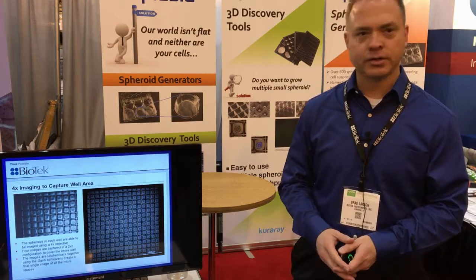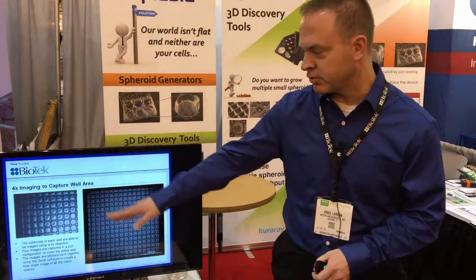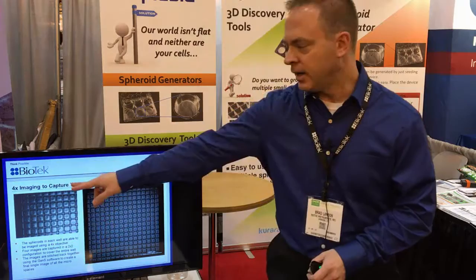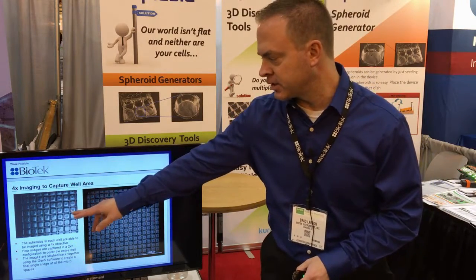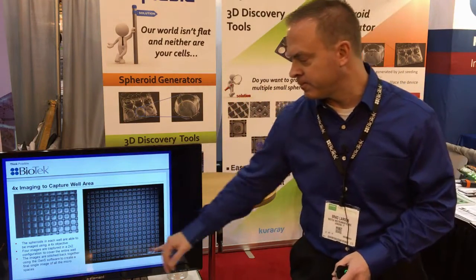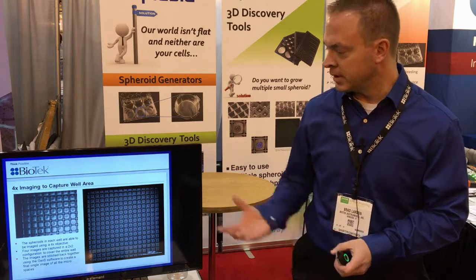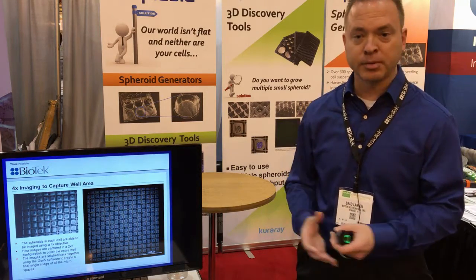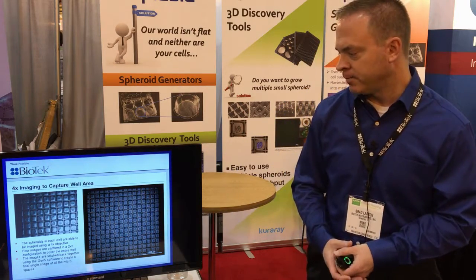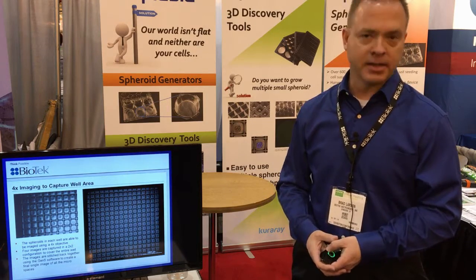The cells were dispensed into the wells of the microplates and aggregated over time. Using brightfield imaging with a 4X objective, you can see an example of one of the tiles captured, showing the spheroids in each of the individual micro spaces. This is then the final stitched image, giving you an easy capability to monitor aggregation of the cells into spheroids over time to confirm they're ready for your final assay.